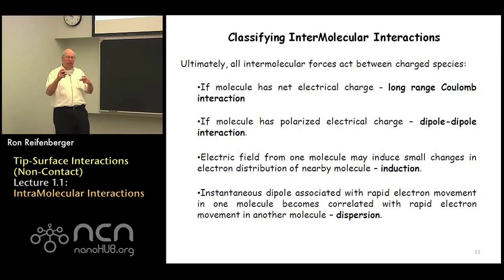We'll actually show you how these various quantities depend on the size of the dipole moments in each of the molecules that are considered. But ultimately, these intermolecular interactions all occur because molecules or atoms interact one with another by a wide variety of different electrostatic interactions.